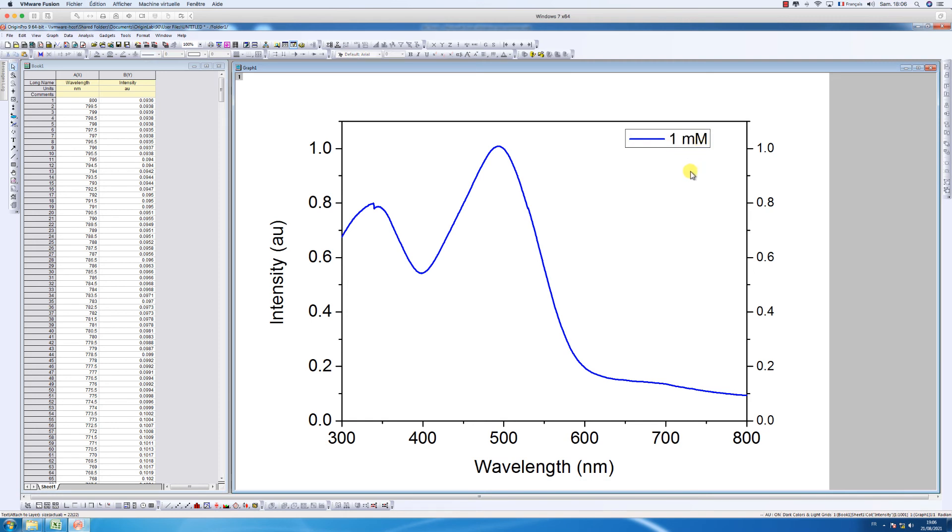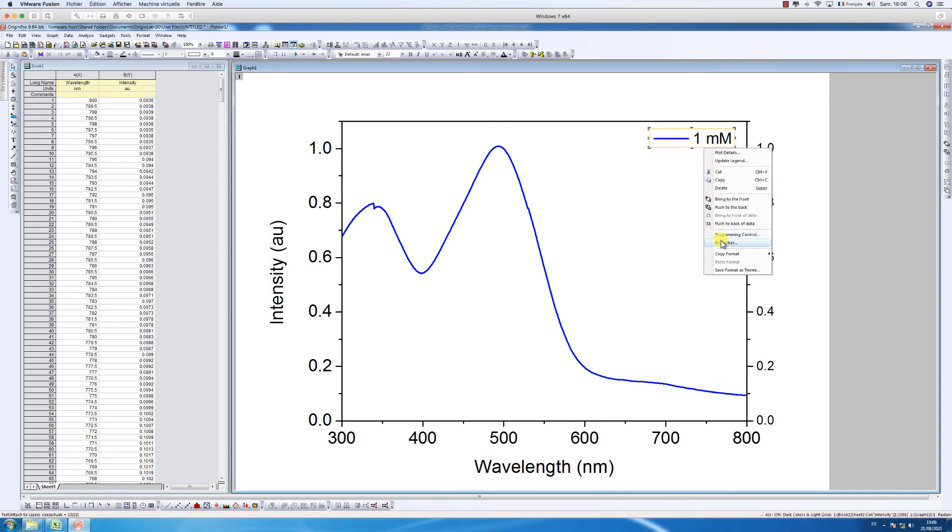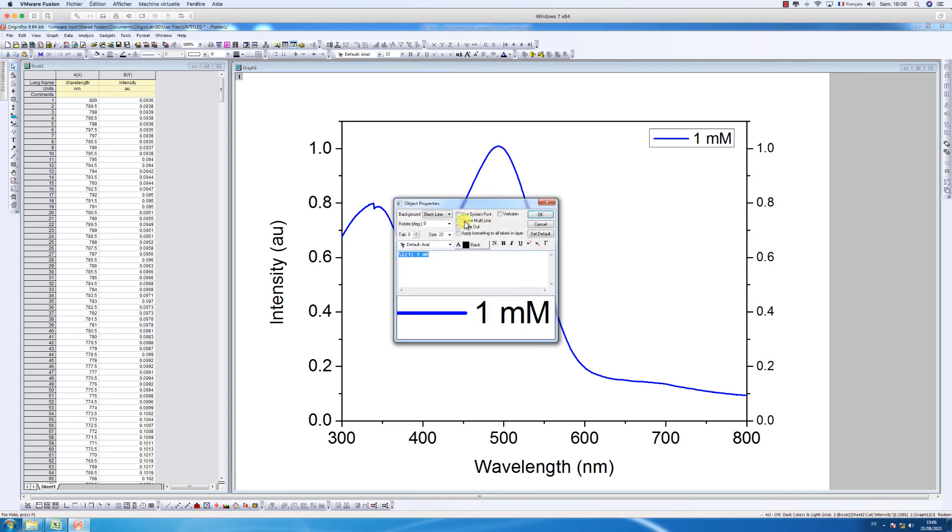To make your graph easier to be read, you can add a grid to it. So just go to grid lines and choose mineral or module grid depending on your needs. And then you can adjust it according to your preferences.